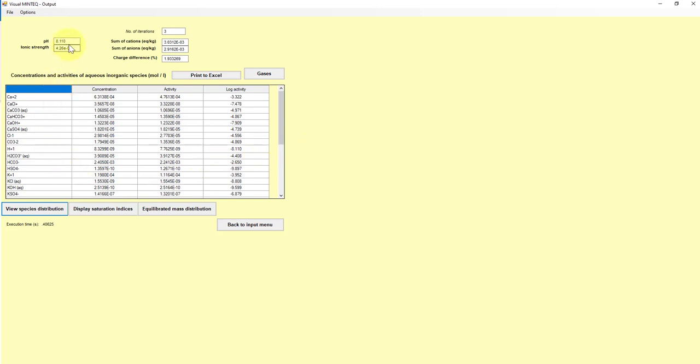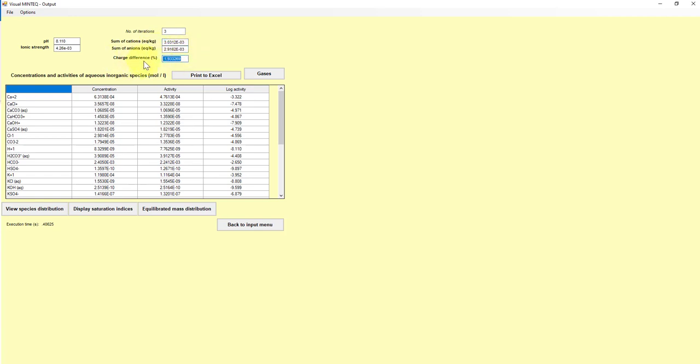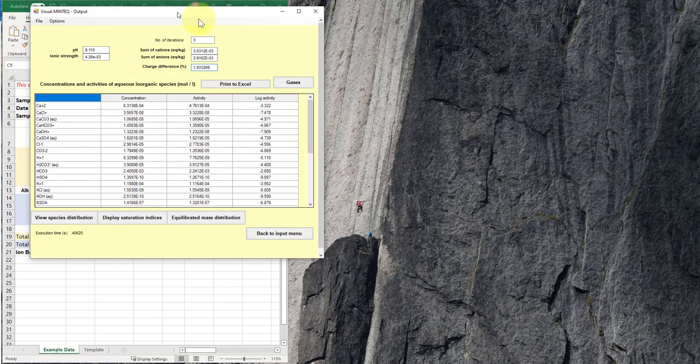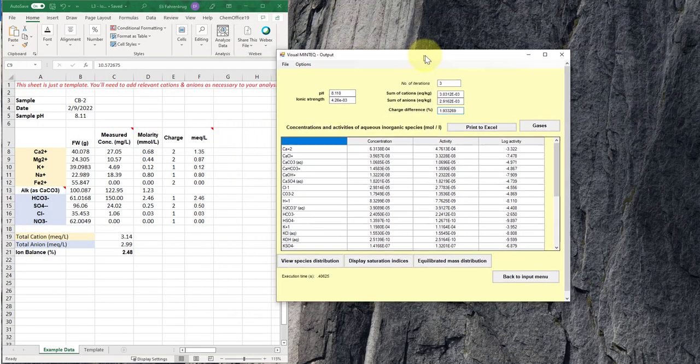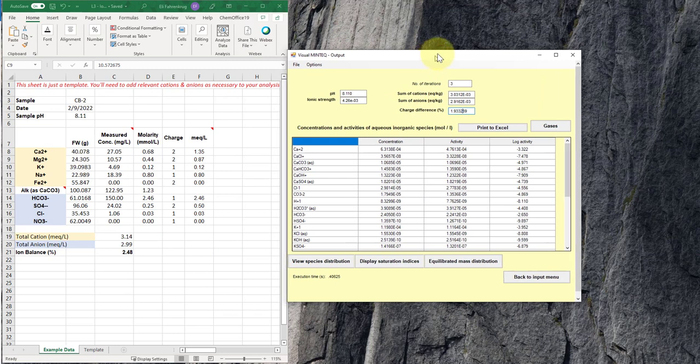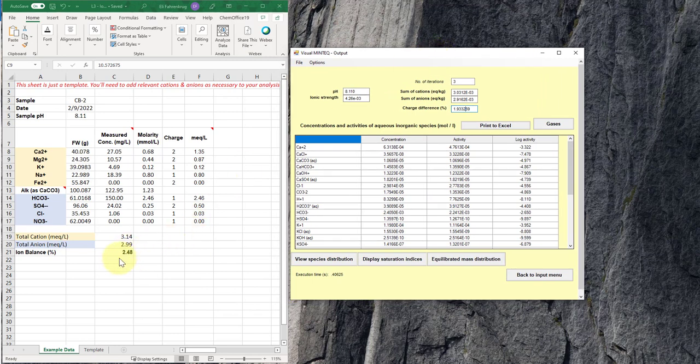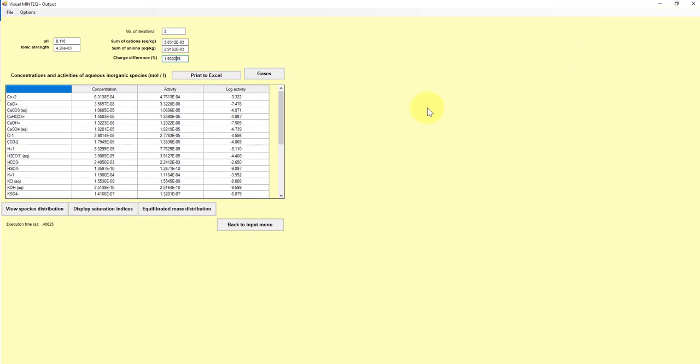So a couple other things. So you can see it computed our total ionic strength here. It ran this for a series of three iterations. It has the sum of cations. This is in units equivalents per kilogram, which is a little weird, but you can convert out of that. And the same for the anions. And then it computes its own charge difference here in percentage, which is the equivalent to our ion balance. And so it's saying that we're about 1.9% out considering all the speciation compared to what we saw of 2.48 for the same inputs using our more simplified Excel spreadsheet model.